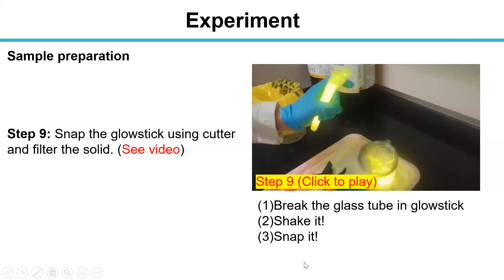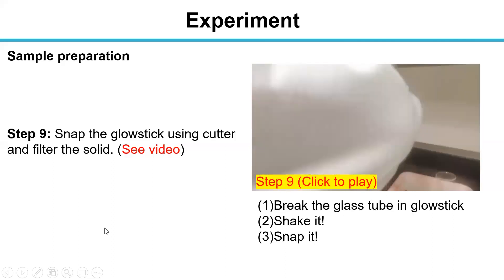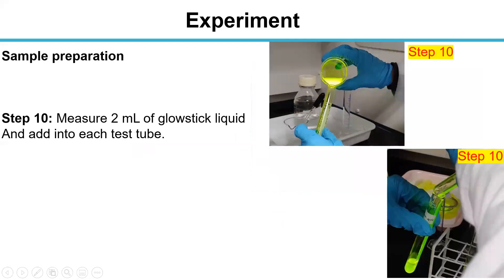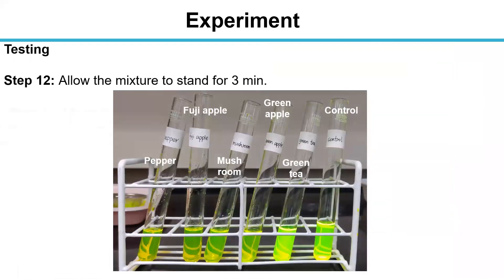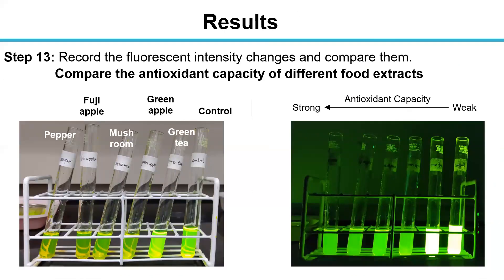Now we go to the next step. In step 10, 2 ml of glow stick liquid is measured and added into each test tube respectively. Then measure 2 ml of ethyl acetate extract of food substances and add into each labelled test tube. Then allow the mixture to stand for 3 minutes. In step 13, we record the fluorescence intensity changes and compare them. We have 6 samples: pepper, Fuji apple, mushroom, green apple, green tea, and a reference.